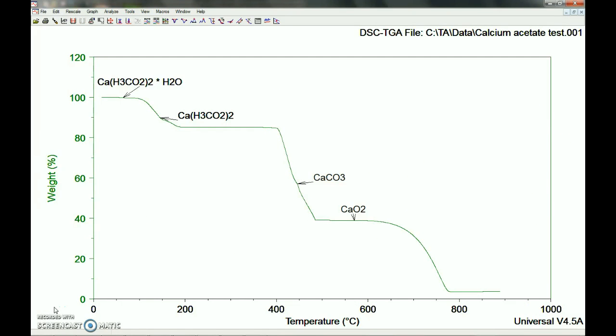But otherwise, most of our information is in this weight percent by temperature graph. Actually, I did want to give a quick note here about further analysis of the graph that you would get here from the TGA.